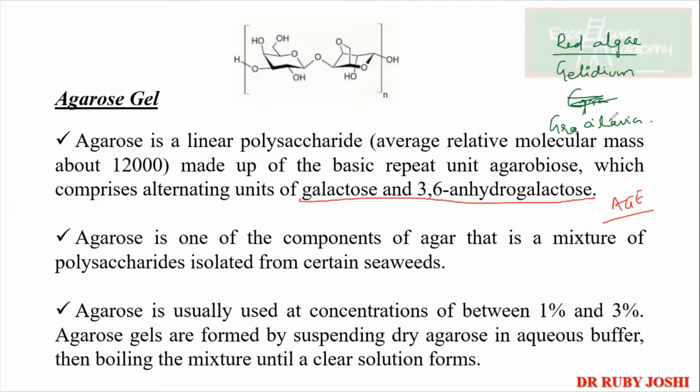Okay? So we don't have an agarose making unit. We do have for agar, because agar is your basic raw form. Okay, it doesn't need that high purity. And if you see, the agar also has color in it. It will be a yellowish brownish color, right? Whereas agarose is the purest one, the white colored one, right? If you have noticed.